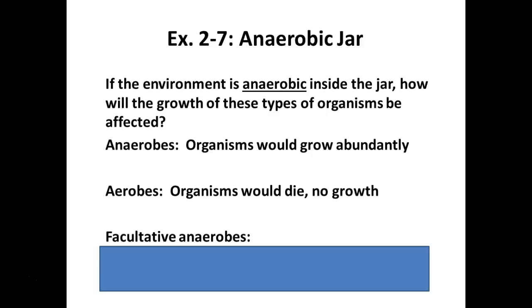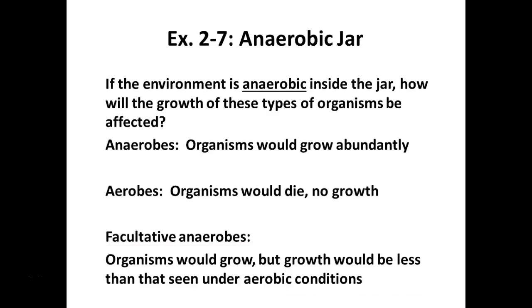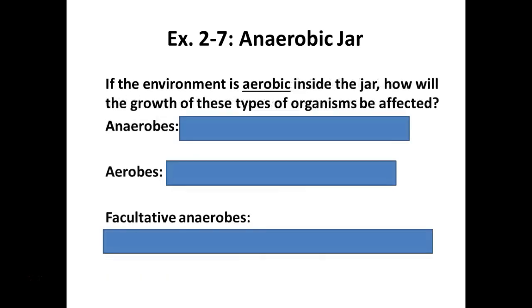What if we stick a facultative anaerobe in here? It'll grow, but slowly, right? Because it's going to have to resort to fermentation probably, which is not as much energy. Make sense? Okay.